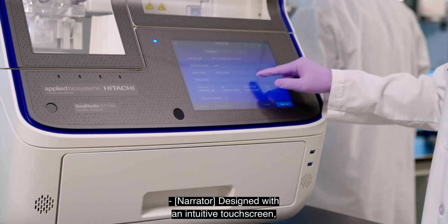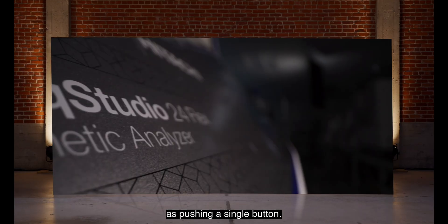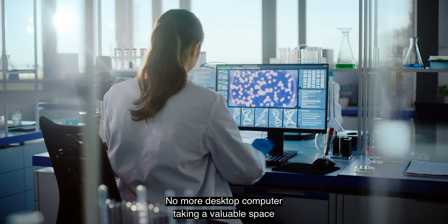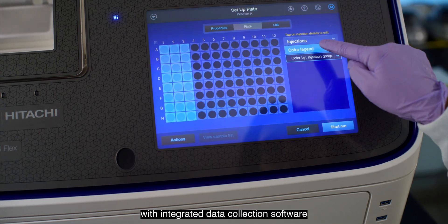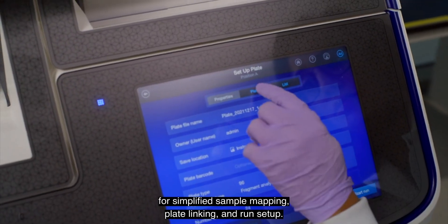Designed with an intuitive touchscreen, running the SeekStudioFlex system is as easy as pushing a single button. No more desktop computer taking up valuable space in your lab. The SeekStudioFlex system has a built-in touchscreen computer with integrated data collection software for simplified sample mapping, plate linking, and run setup.